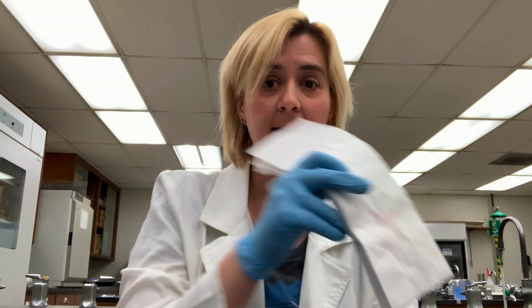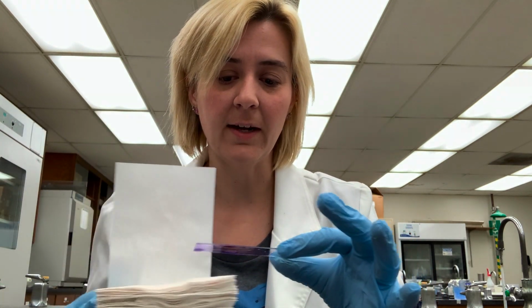Okay. And then what we'll do before we can visualize the slide is we will put it in some blotting paper to soak up the excess liquids. And then once that's dry, we'll go ahead and visualize it. My other smear is not quite dry yet, so we'll come back to that in just a little bit.